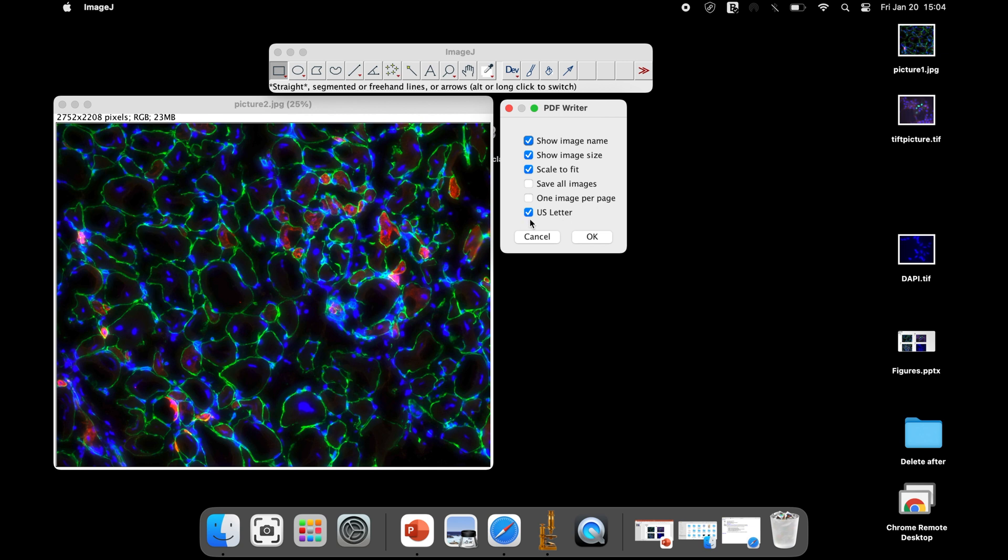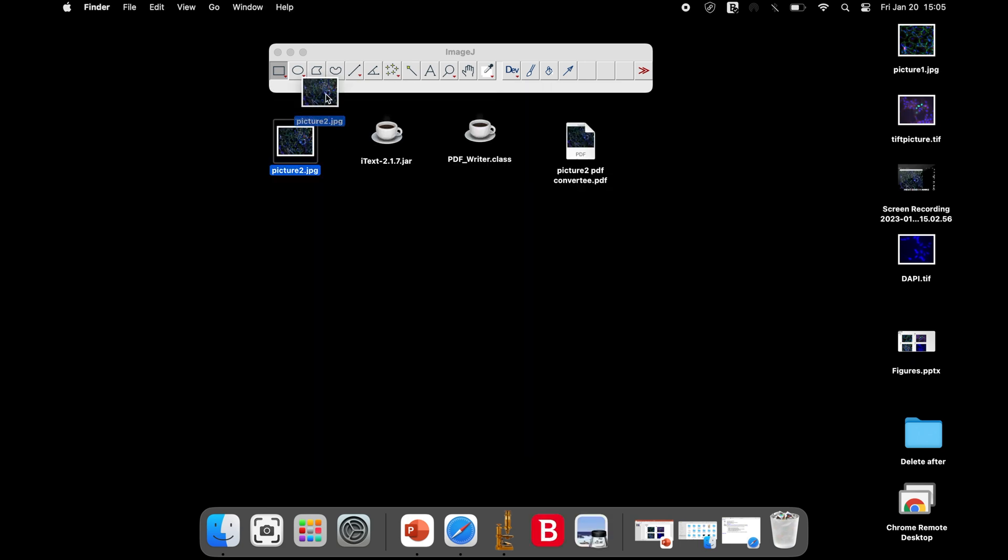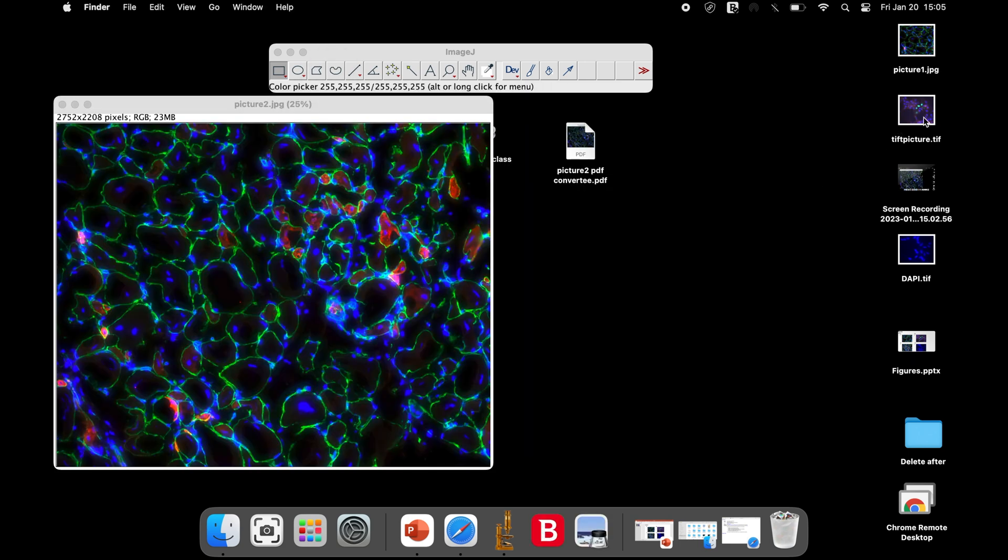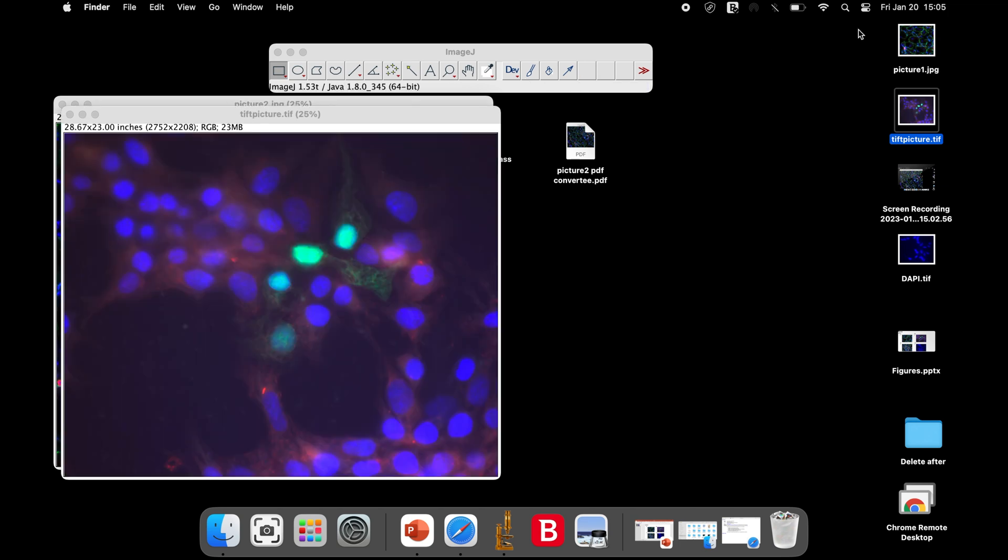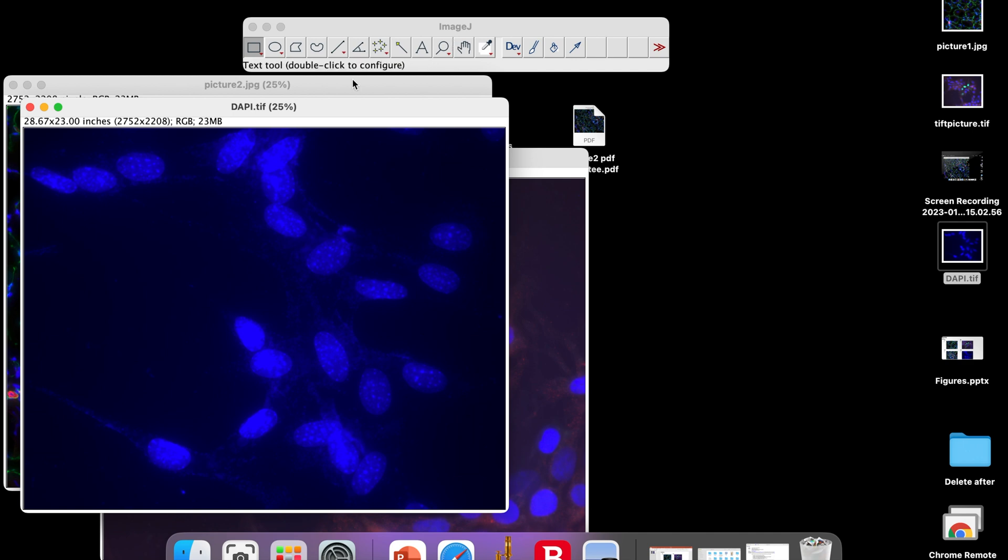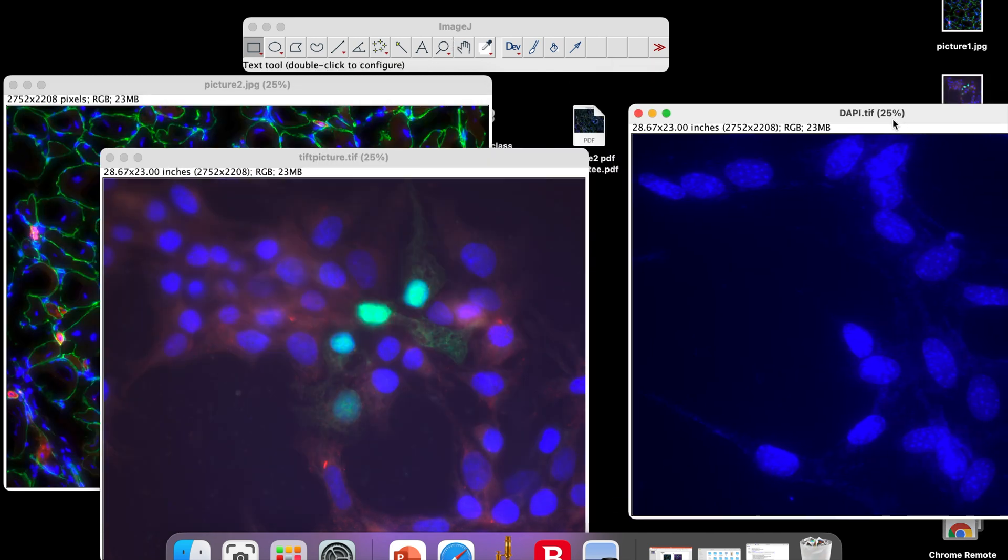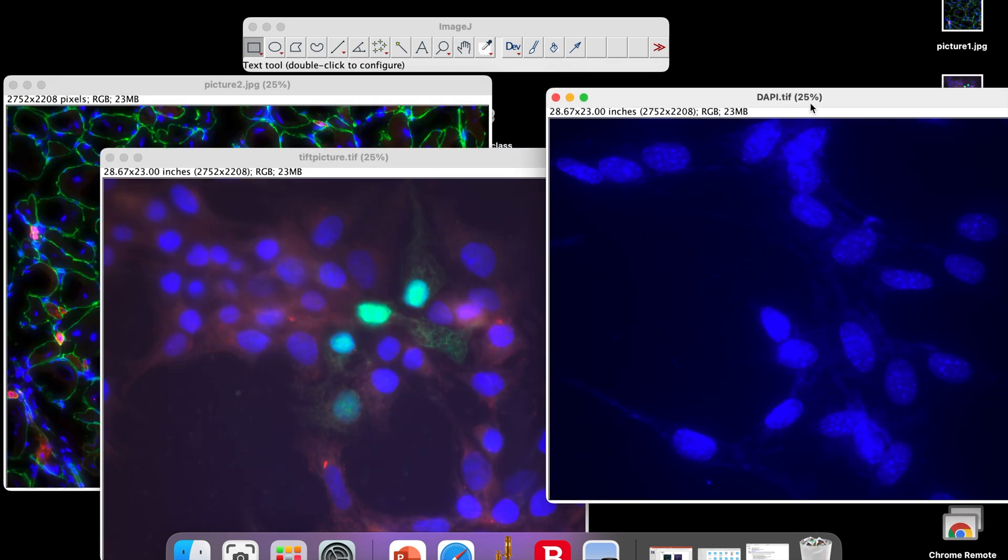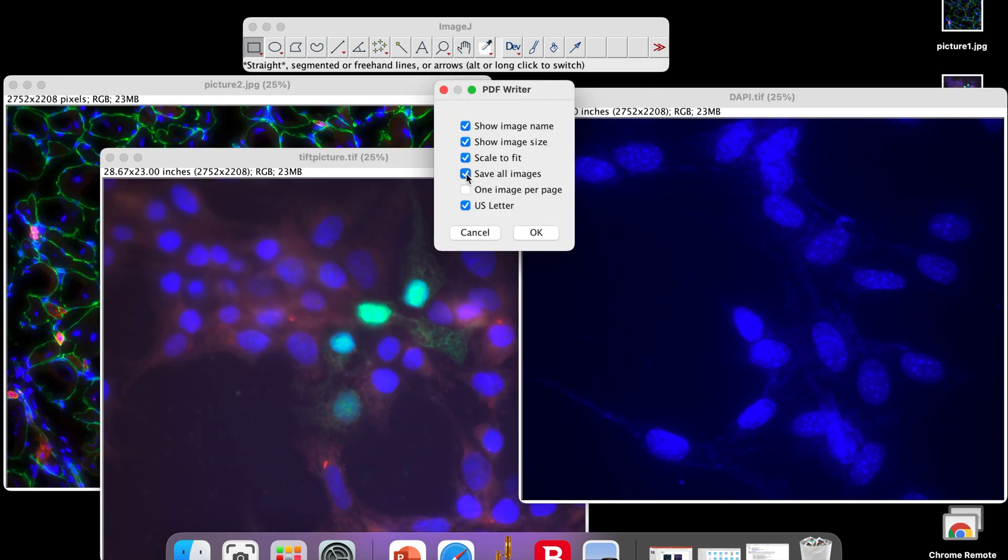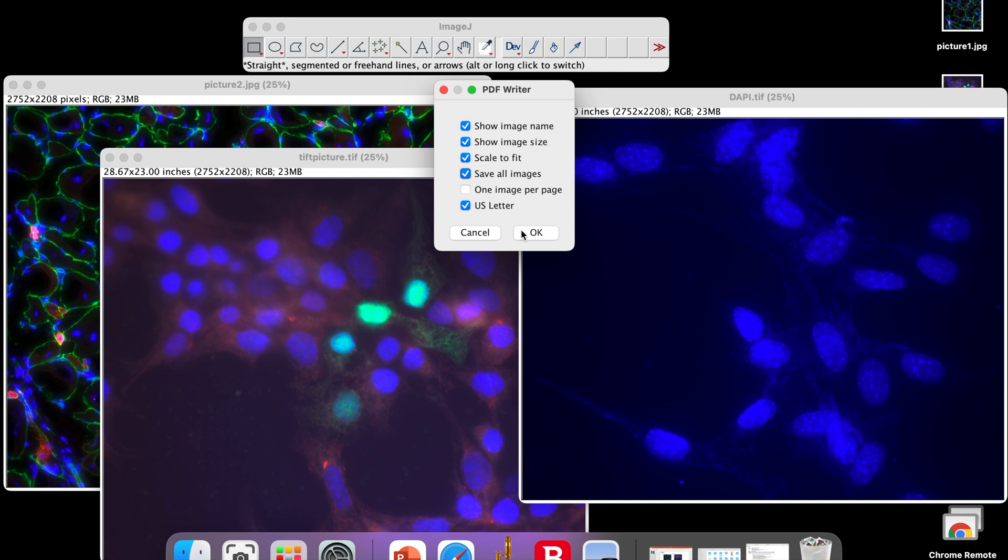The size of the page can be left in its default state or switch to US letter size. To convert multiple images to PDF all at once, open all the images using ImageJ software and then check save all images option. If the required output is one image per page, then this option can be checked. Else, any number of images can be grouped in a single page depending on the size of the image.